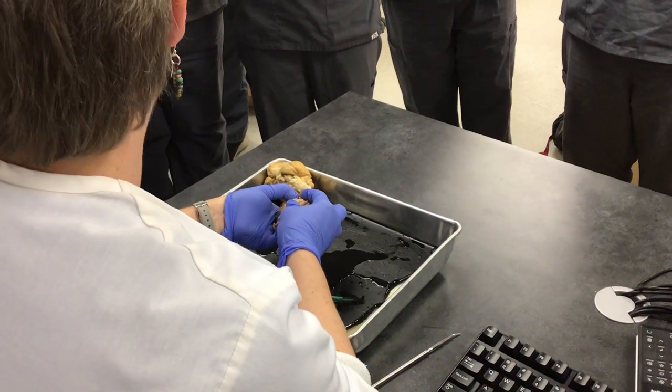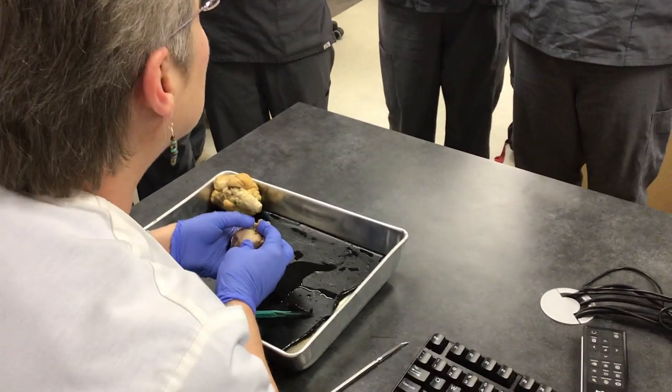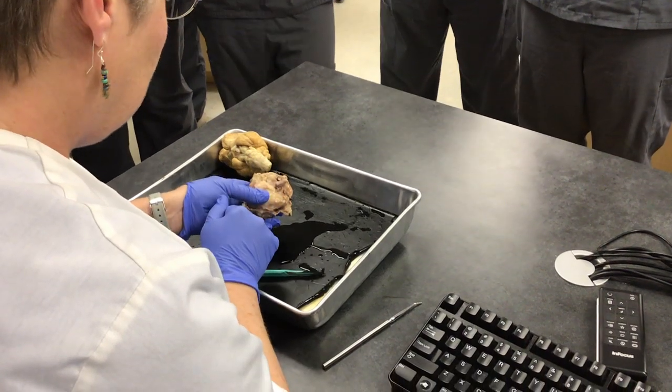Do you know what that is? The optic nerve. It's the optic nerve, okay? So cut all around, but don't cut the optic nerve.